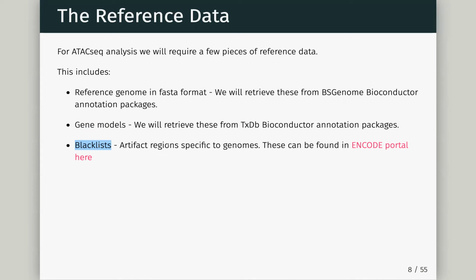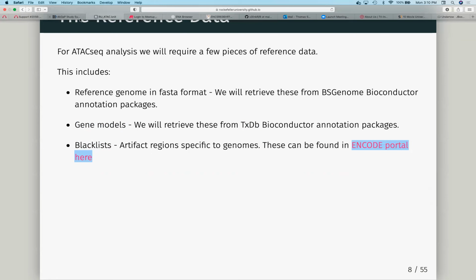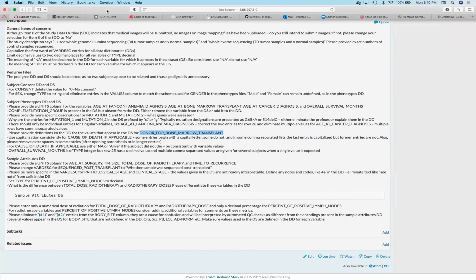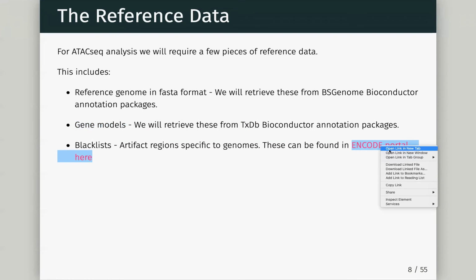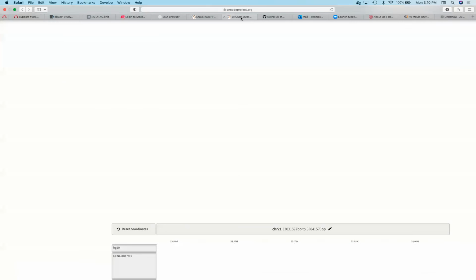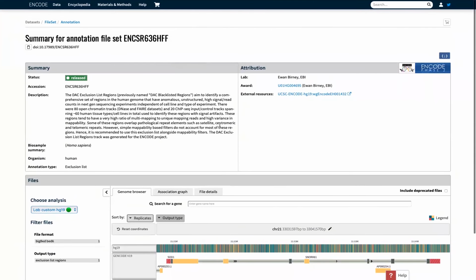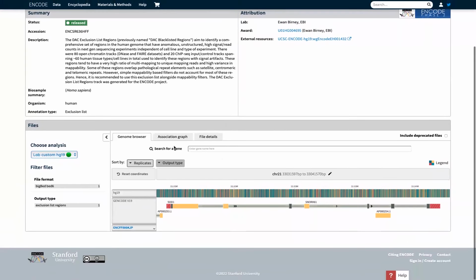This is the blacklists. I'm not sure if anyone knows about the blacklists. It's fascinating. See if we can, what it pulls out if I go to the ENCODE study. See, maybe I didn't follow quite the right link. Try it again. Do you have any history on it or anything, or a PubMed link maybe?